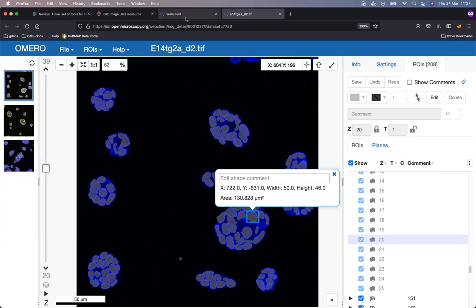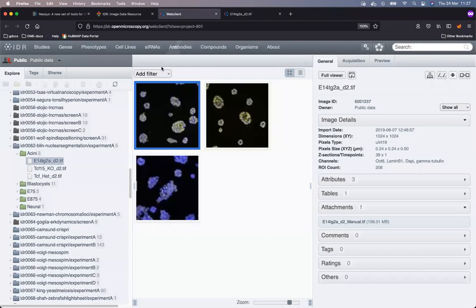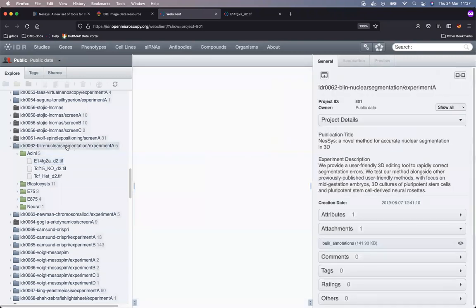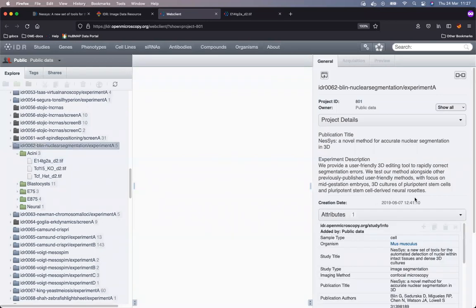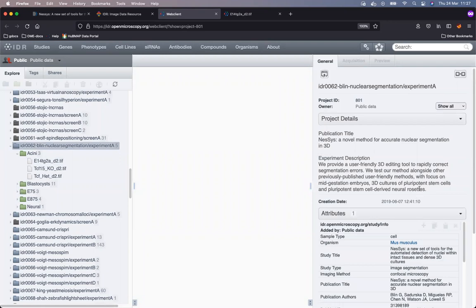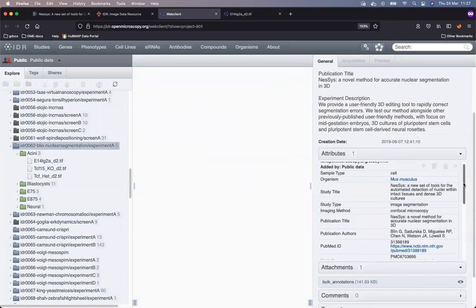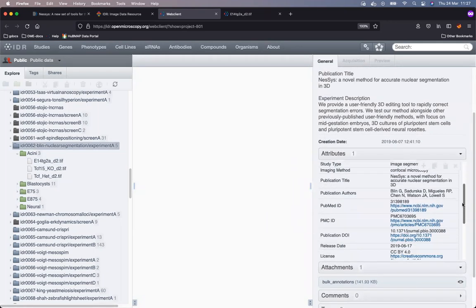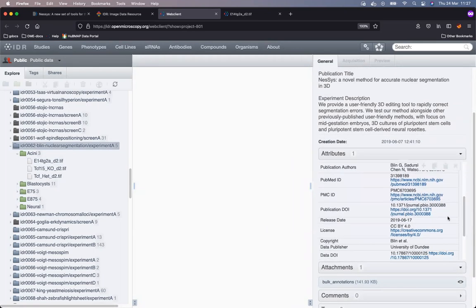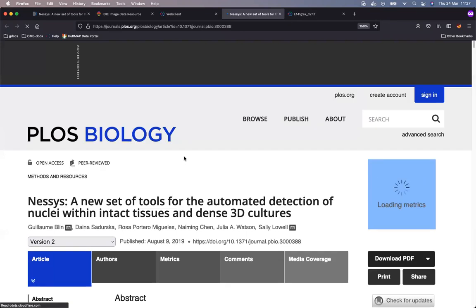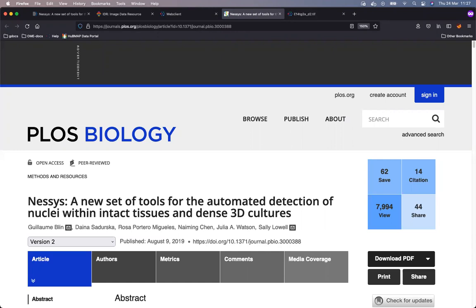I will go back to the OMERO web, select the top level container representing the study, and study its metadata on the right hand side. In the attributes section, I have some very important metadata such as license information and publication DOI, on which when I click, I will land in the PLOS Biology in the publication on which I started my video.